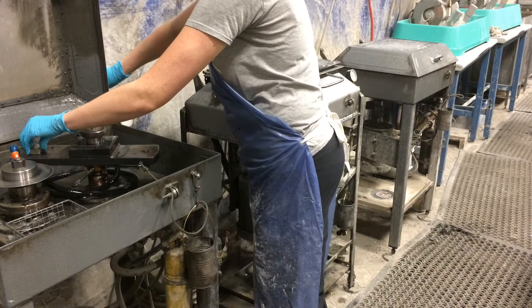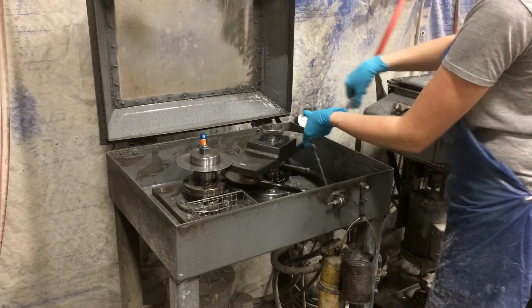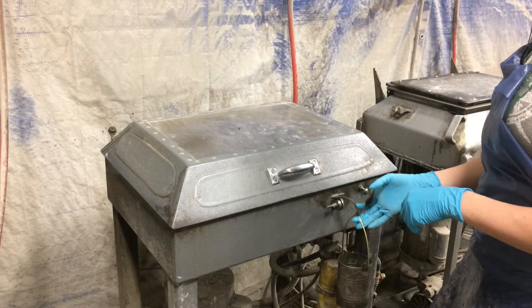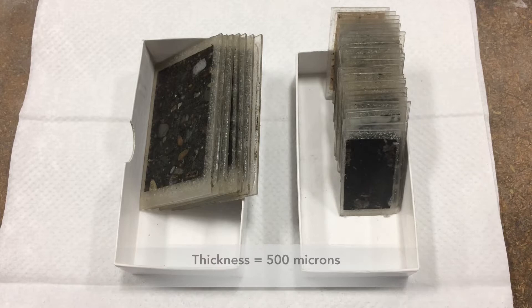All steps after mounting are focused on progressively thinning the slide towards a final thickness of 30 microns. The cutoff step detaches extra sample from the future thin section. Our cutoff saws are homegrown designs built by Spectrum's co-founders. Inside the saw basin, the slide is attached by vacuum to a horizontal chuck arm, the lid is closed to contain splatter, and then an external weight is freed so the chuck arm passes the sample through the blade by force of gravity. The cutoff billet is saved and can be resurfaced into additional thin sections if necessary. The section is now approximately 500 microns thick.